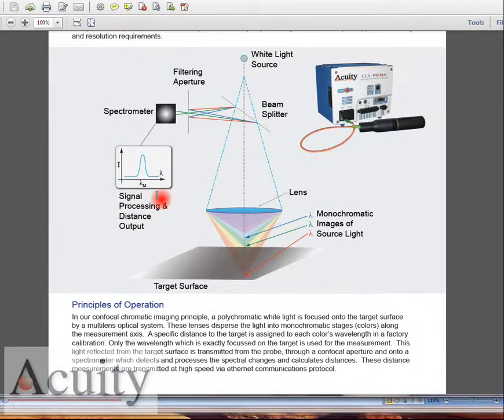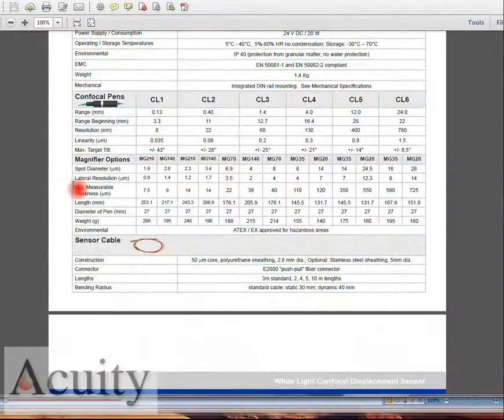The advantage is it's a constant spot size. It can measure almost any surface out there from mirrors to clears to wets, and it just does a very good job on a lot of difficult surfaces. We also have quite a few different probe sizes.